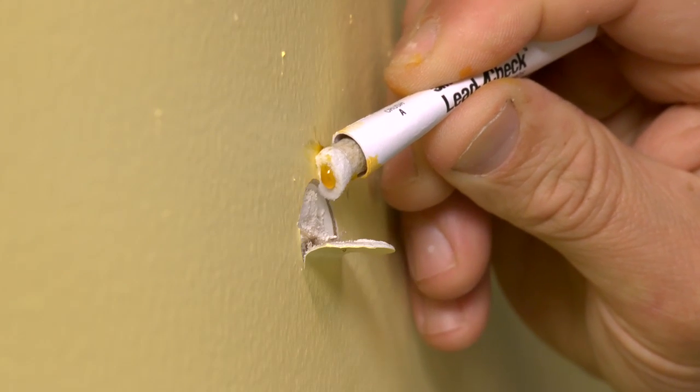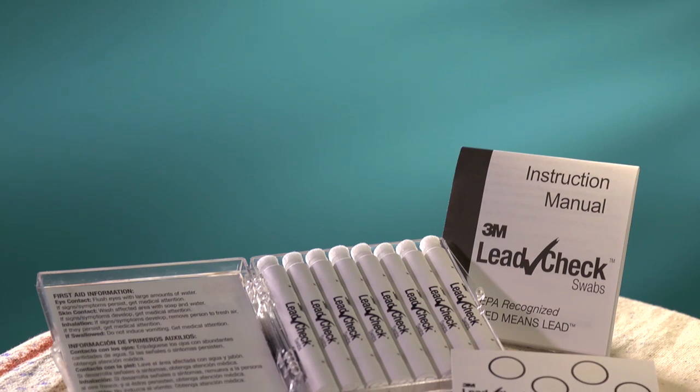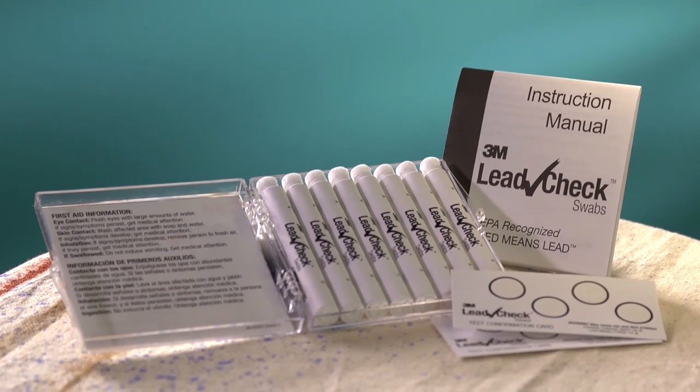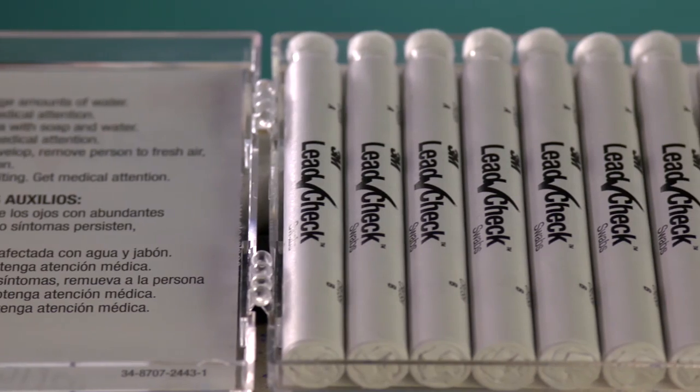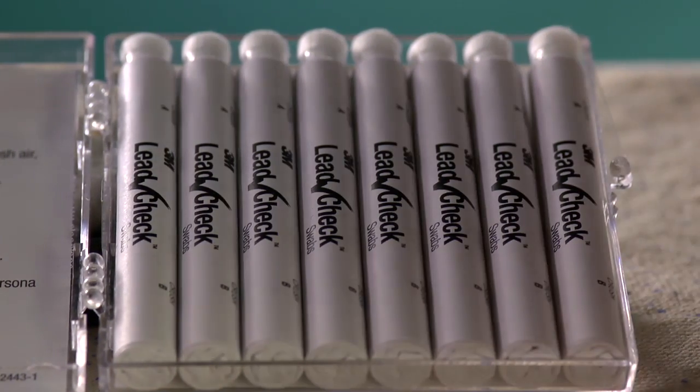This test method is for testing painted drywall and plaster surfaces for the presence of lead. This method is described in detail in the instructions that are in your kit. For this test, you will need one or more 3M LeadCheck swabs.